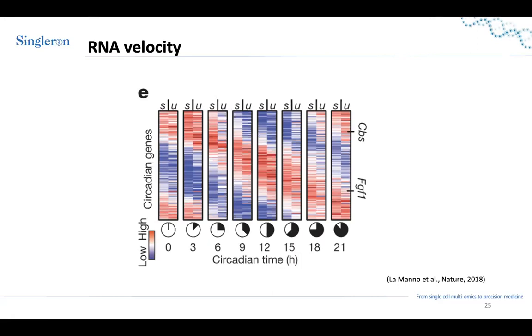I remember you had a picture of a device where cells are pushed through a small narrow path, and in another path there were the droplets that contain the UMI and other barcodes, the beads. And they are pushed together into one single lane to undergo, I think, amplification or something.